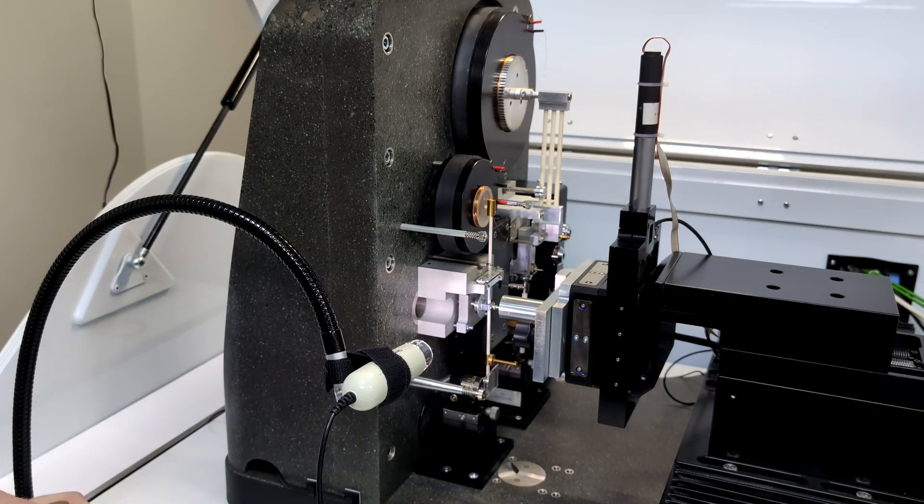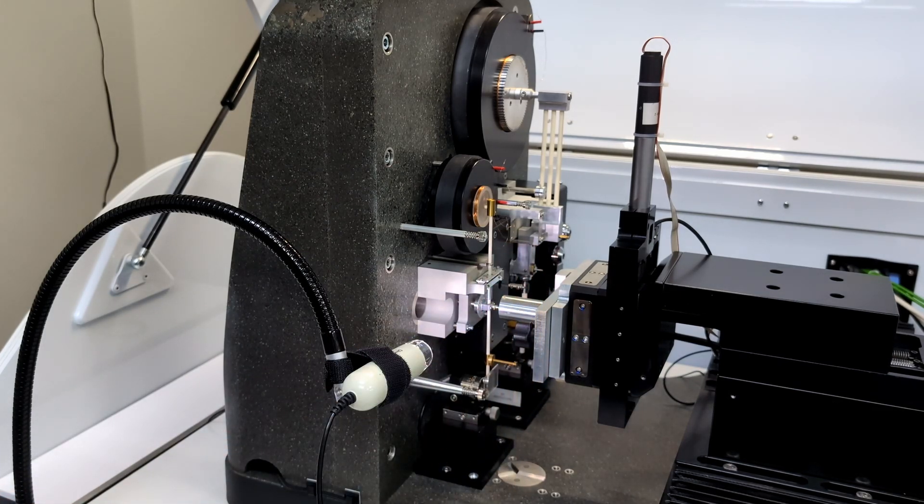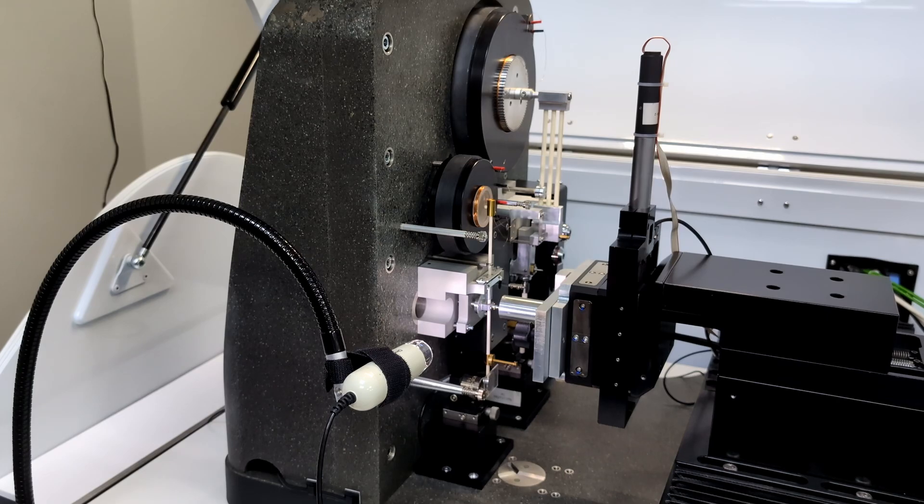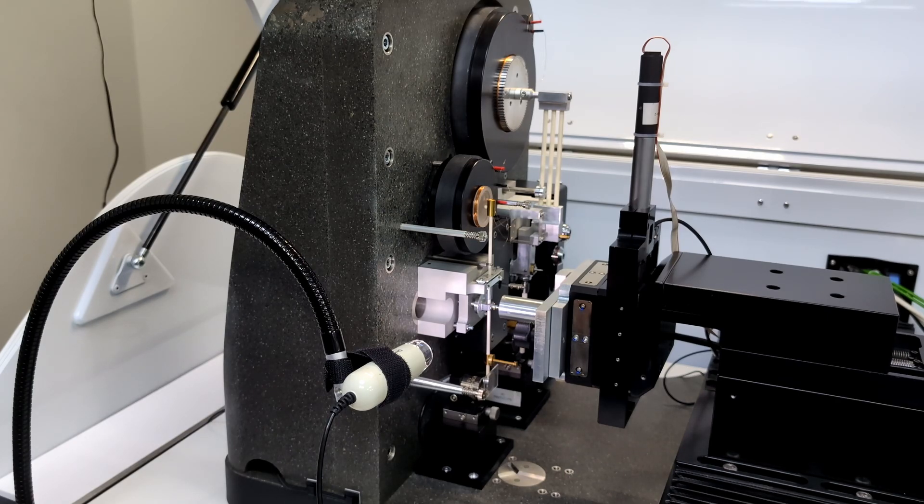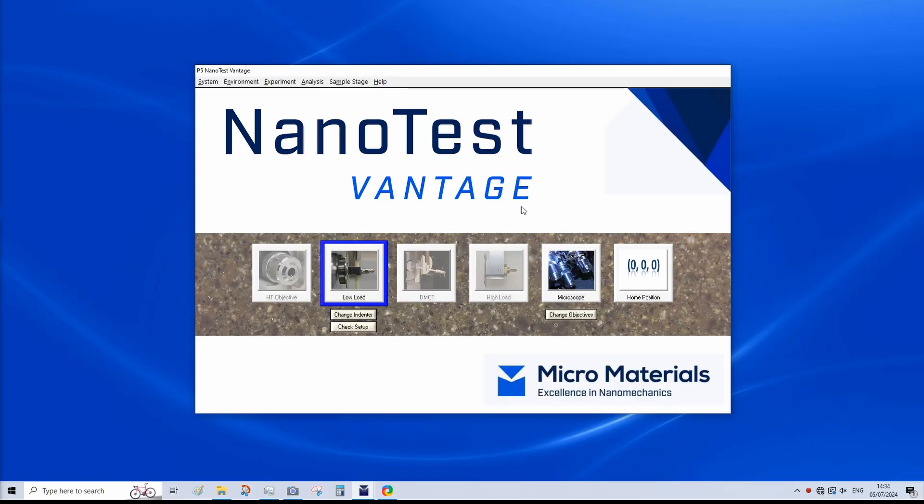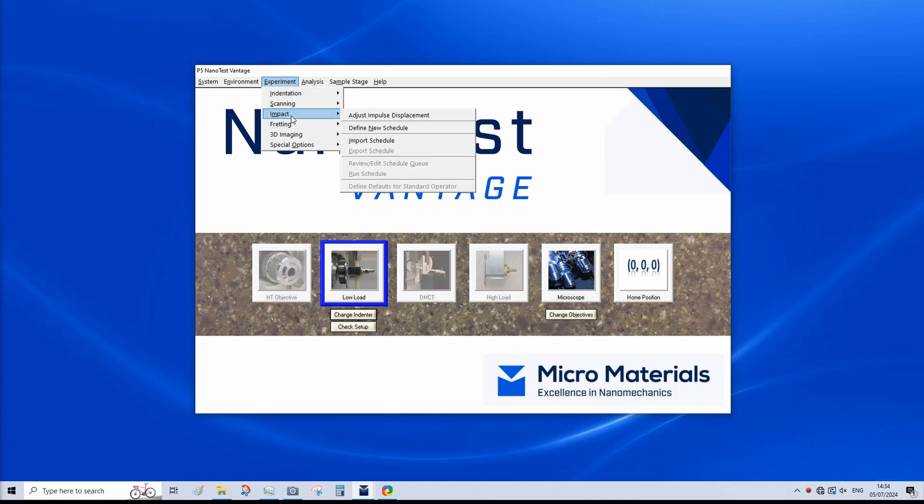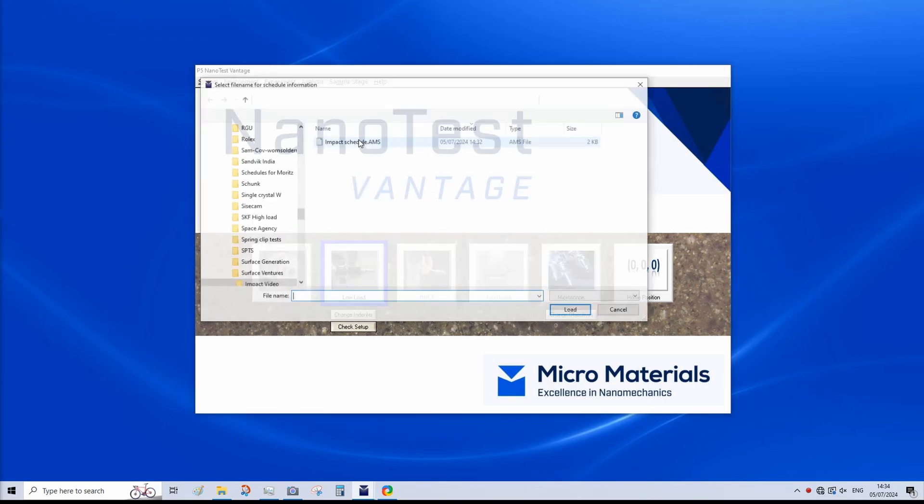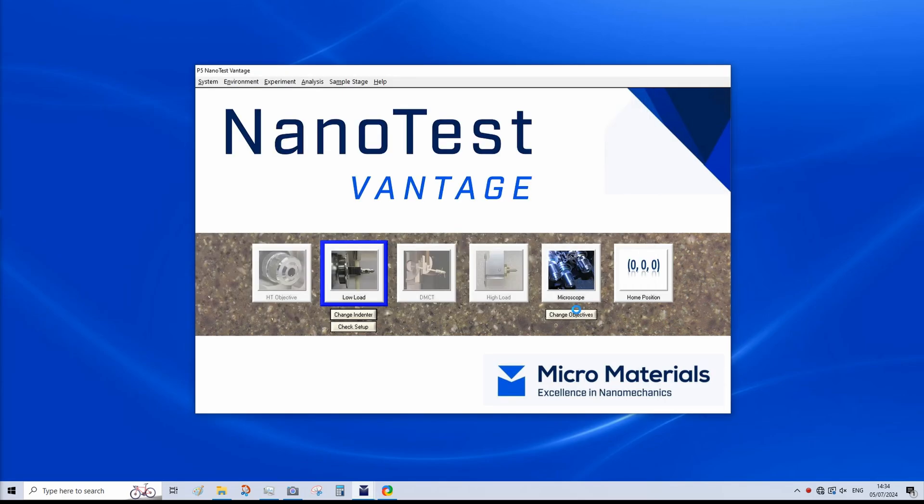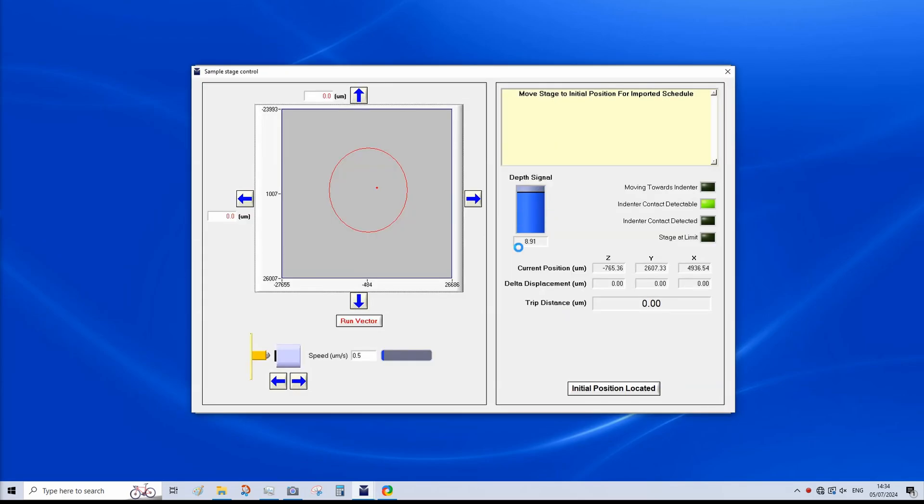And in the platform itself, we have the sample that we're going to test. So let's now move to the computer, where you can see the software setup. Now we can set up our test. So for this, we go to experiment, impact. We can either define a new schedule, or as we will do now, import a schedule that has already been defined. I'm going to click import, load. We are at the initial position.